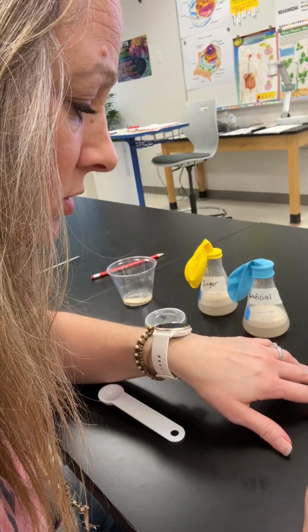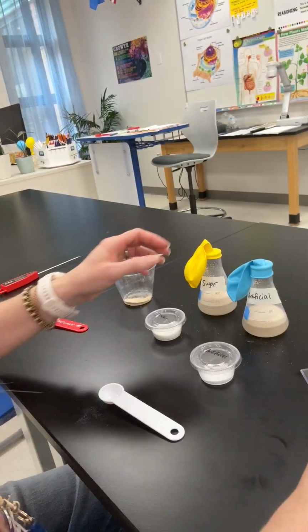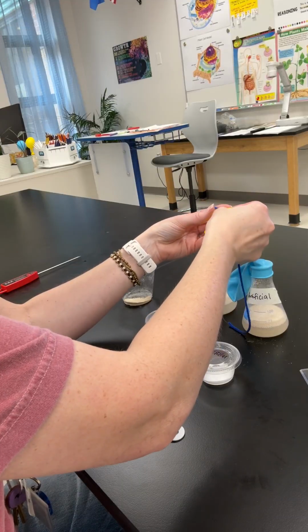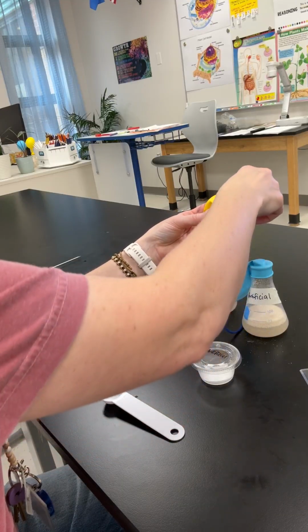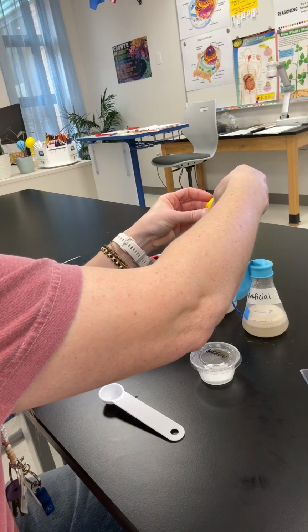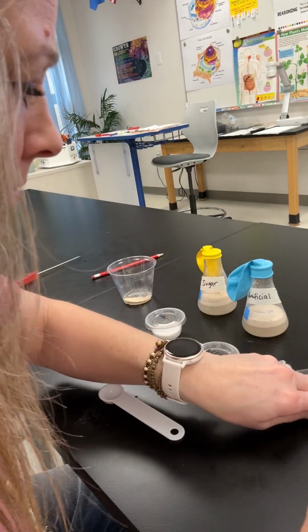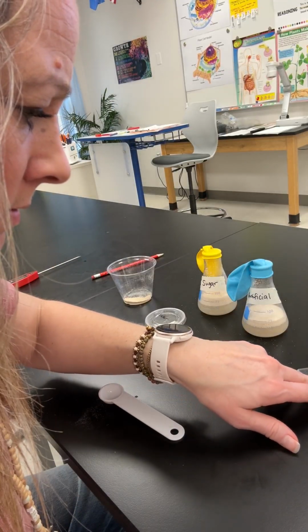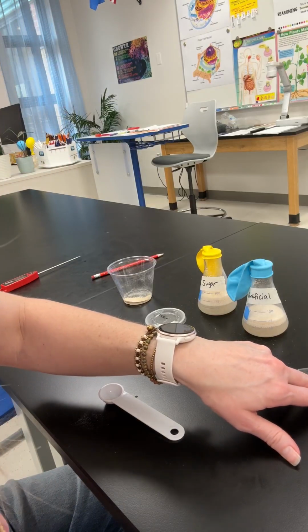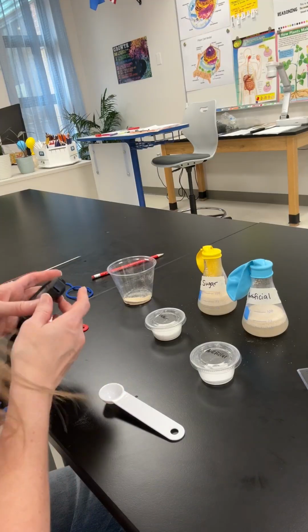For the artificial, it's still at 13. The sugar feels a little more inflated. The artificial one was a little bit, and this one seems to be a little bit more. All right, so this one is at 14 centimeters circumference. Make sure you add those to your data table. We'll continue with that timer.